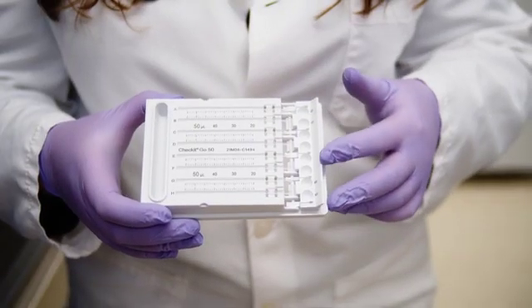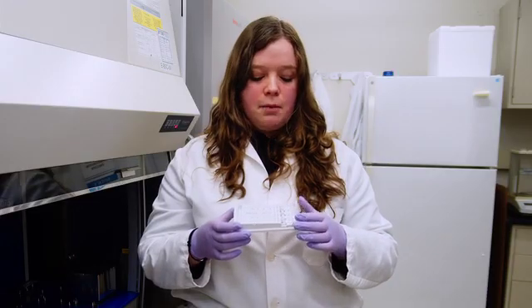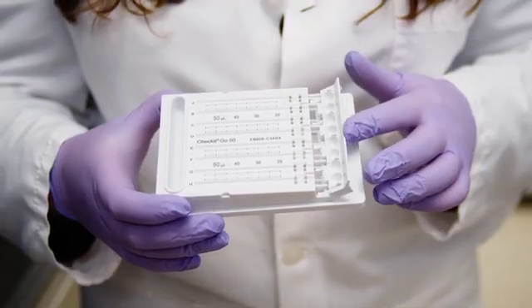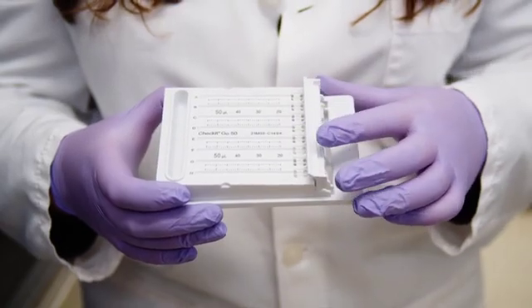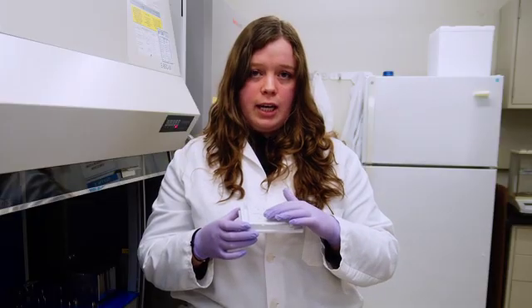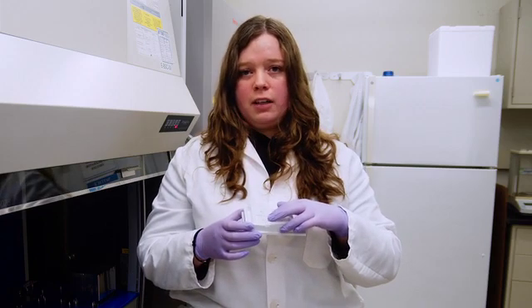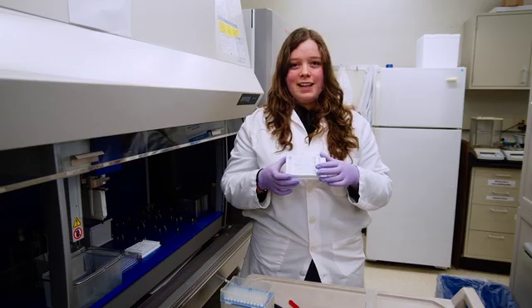On this side of the Checkit, you will see that we have 8 individual dye wells. After our instrument is done pipetting into these wells, we will flip up the tabs so that the dye is able to make contact with the end of the capillaries. Now, through capillary action, the dye will move up the Checkit, and it should stop on the line that your pipette or your robotic liquid handler was supposed to dispense. This will indicate that your instrument is in calibration.